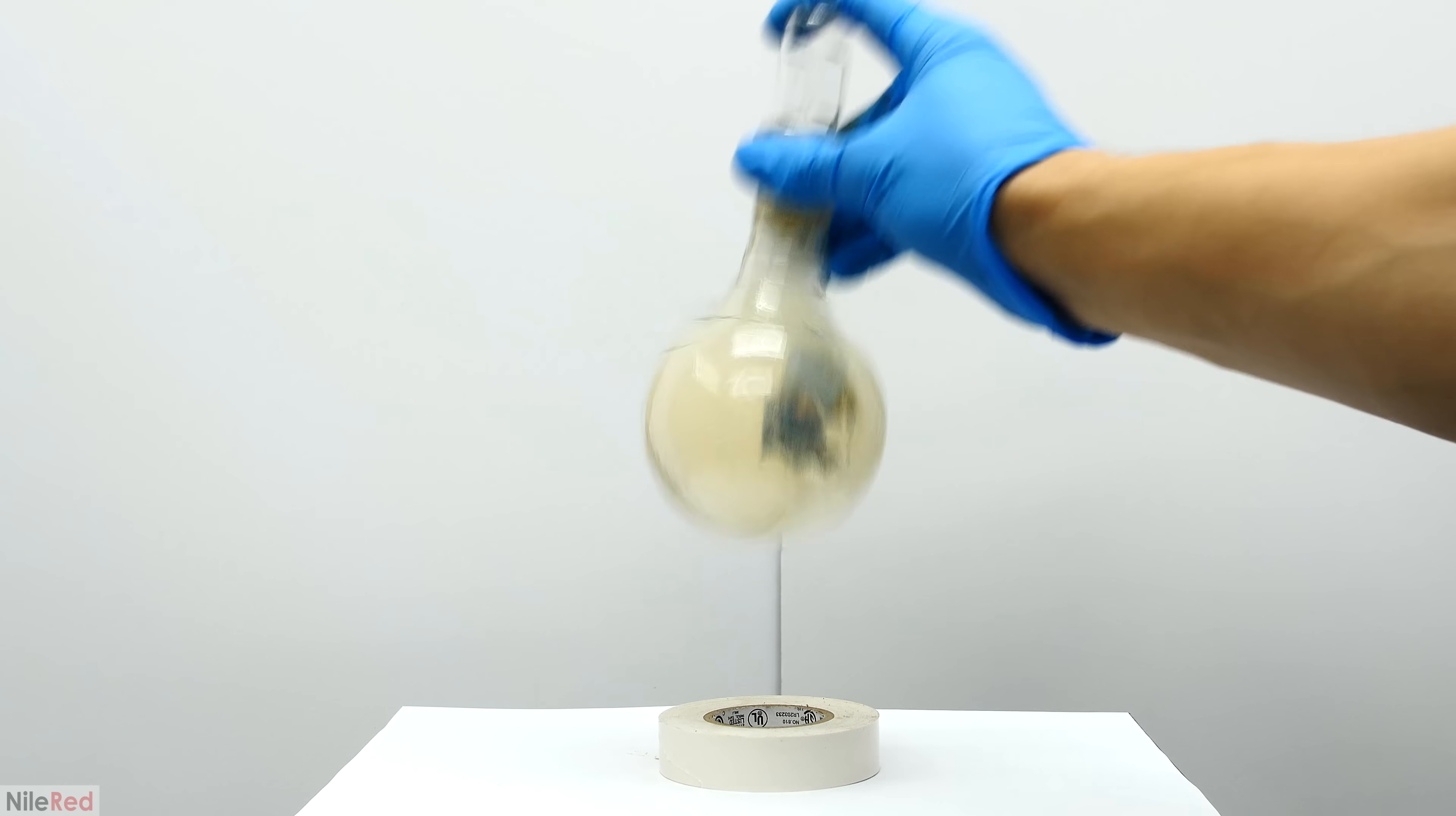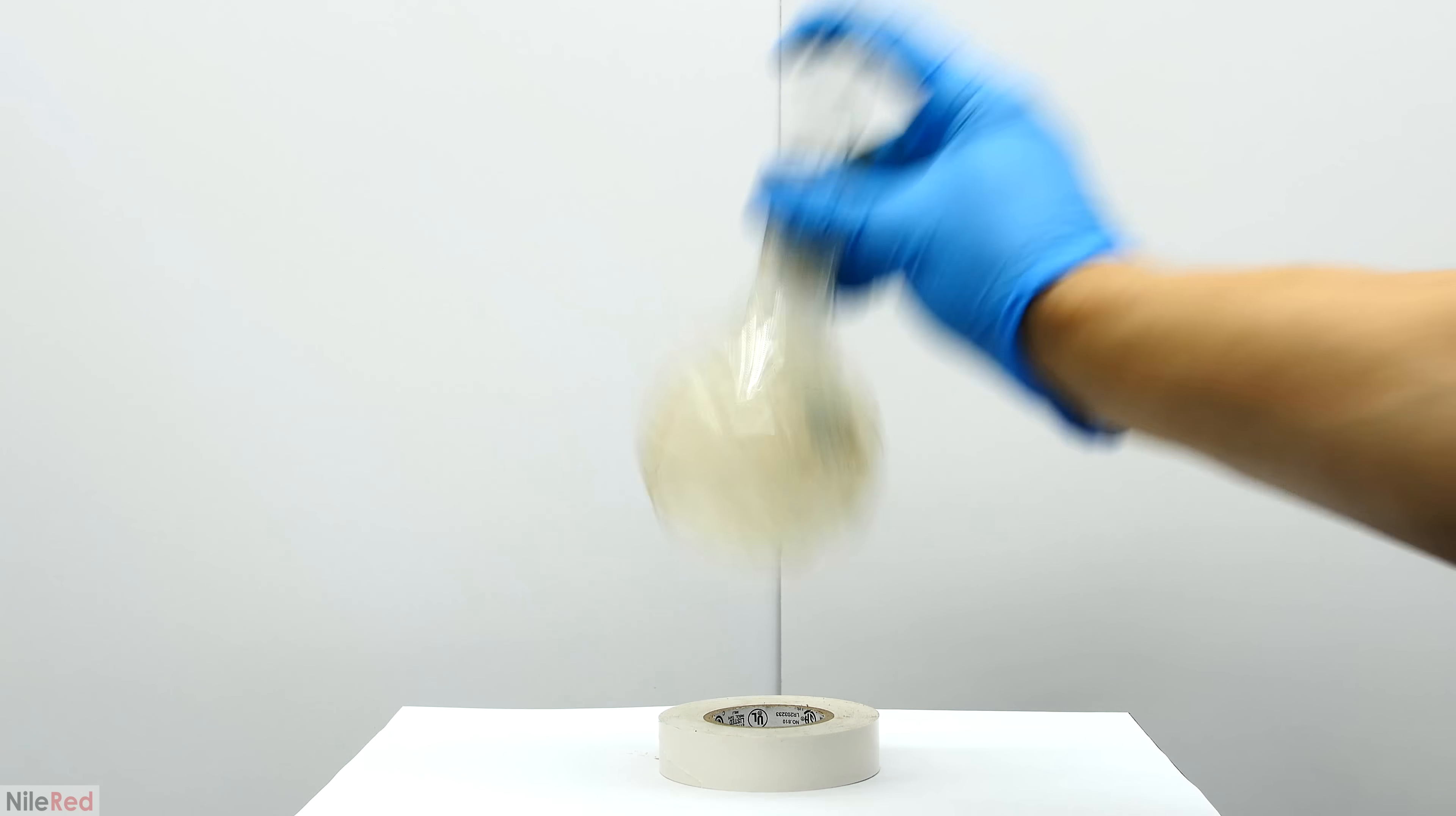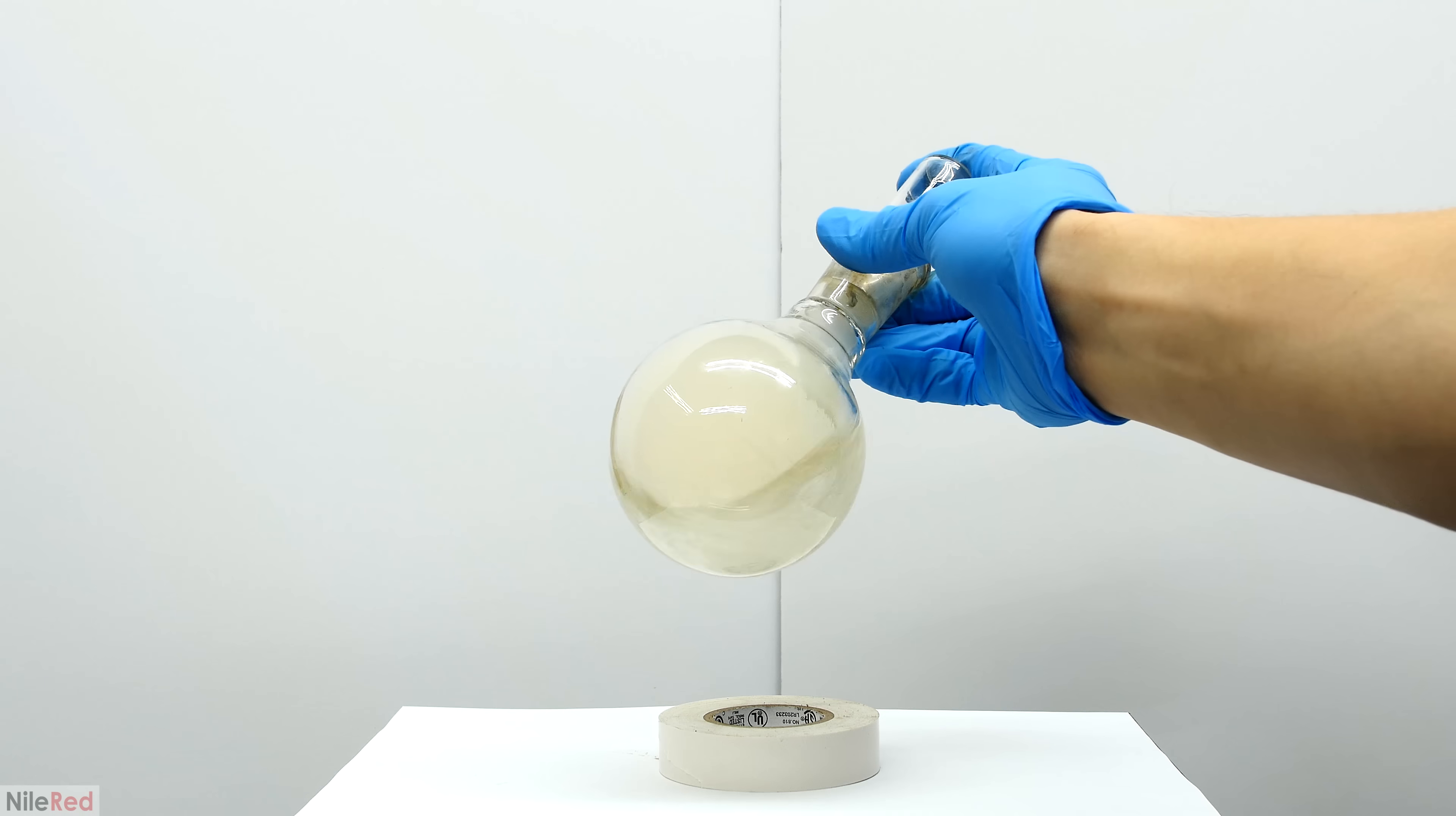After just several seconds of shaking, the flask is pretty clean. The brownish color that you see is not silver, and it's actually nitrogen dioxide gas that's been let off by the nitric acid.